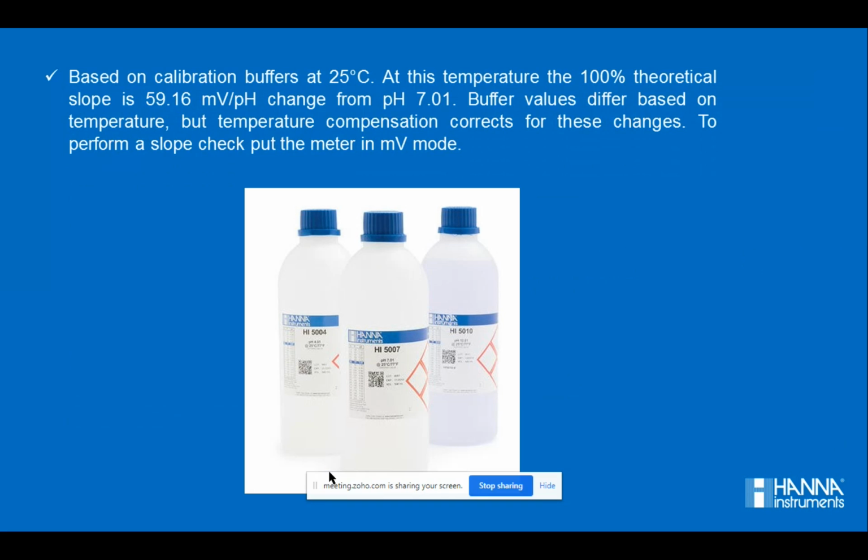To verify whether you have to change your electrode or the buffers, you just have to verify whether your buffers are giving proper millivolts or not. Every buffer has a particular millivolt value, and according to these millivolts the electrodes are calibrated. You just have to test the millivolts of the buffer to verify whether the buffers are fresh or not, and then you will understand whether the issue is in your buffers or in your electrode.